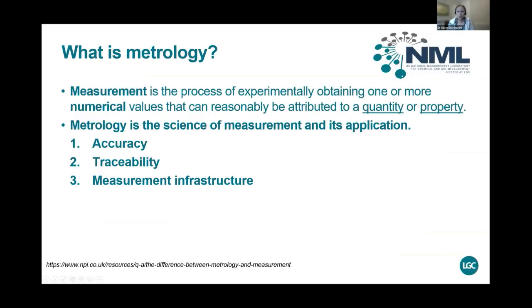So I'm going to structure my talk today around three key aspects in the world of metrology and what it really seeks to support. Firstly, I'll be talking about the accuracy of testing, and then I'll be looking at some of the concepts to do with traceability and how that can support MRD testing. And then finally, I'll talk a bit more about the measurement infrastructure that we have nationally and internationally to support accurate measurements around the world.